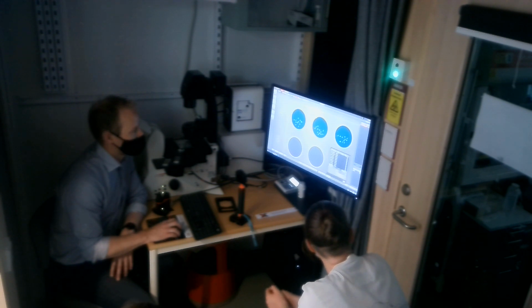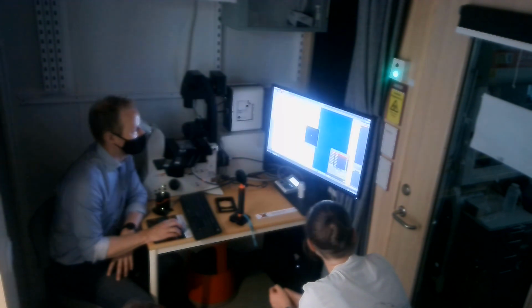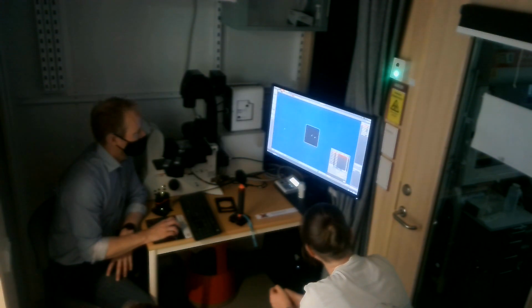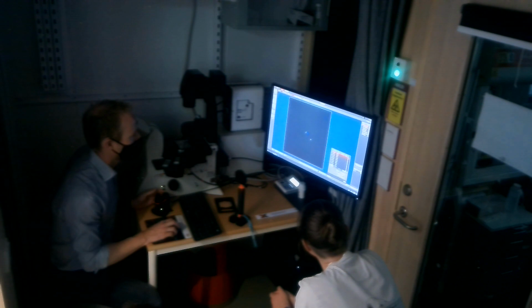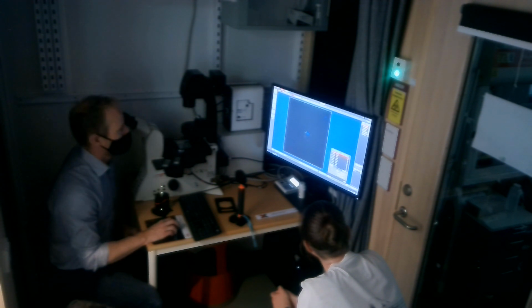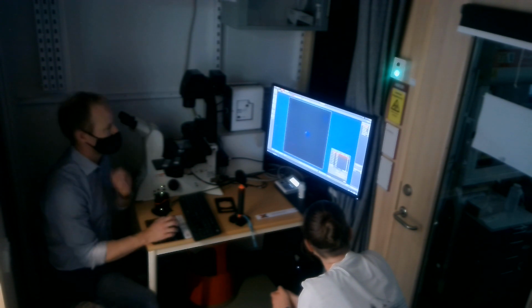I will open the focus map, go to the first position, go live, and I have to also activate this. Just deactivate. There we go, and I will set the focus. There. Good. And then I would just find by autofocus the others in the scene.